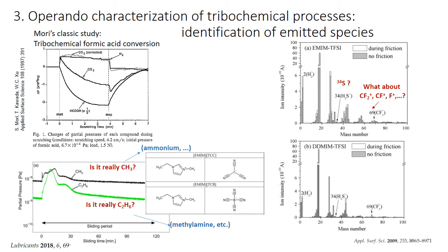This should be taken into account. When you suggest that some component of the mass spectrum should be assigned to a certain ion, you should demonstrate all the possible ions coming from the same molecule. All these ions should be present. You should not say that this corresponds to CF3 if other fragments are not demonstrated, because none of these fragments can come alone from the same molecule.